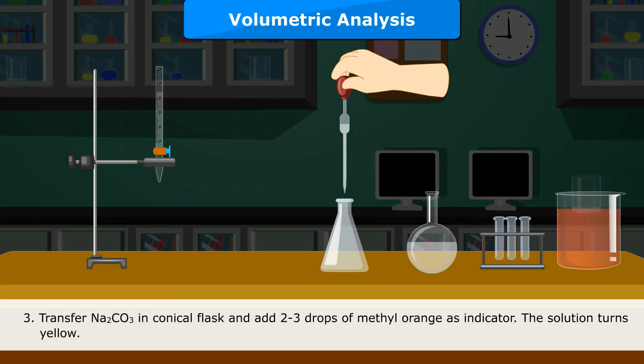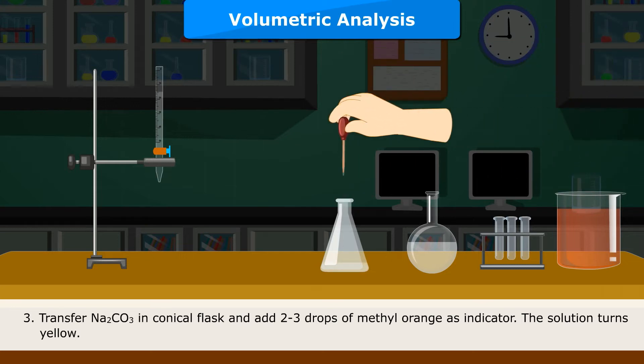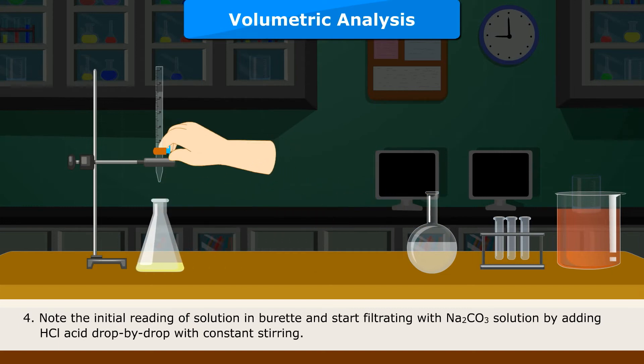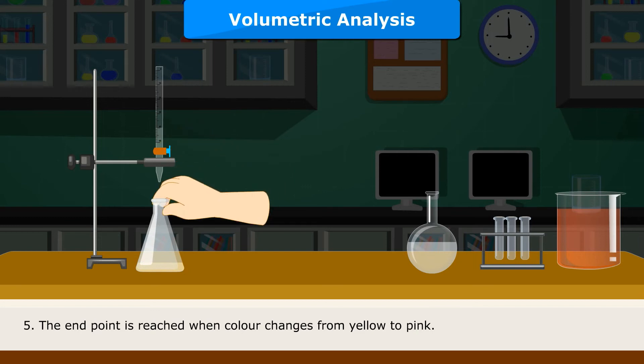Transfer Na2CO3 into conical flask and add 2 to 3 drops of methyl orange as indicator. The solution turns yellow. Note the initial reading of solution in burette and start titrating by adding HCl acid drop by drop with constant stirring. The endpoint is reached when color changes from yellow to pink.